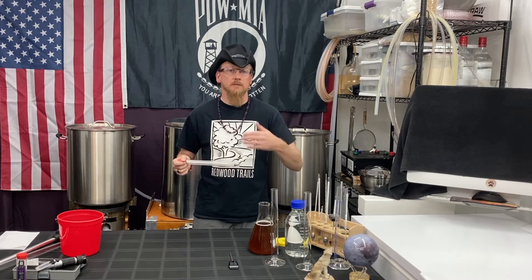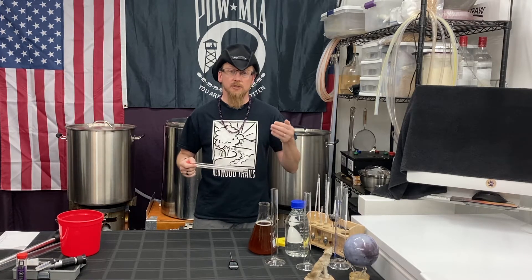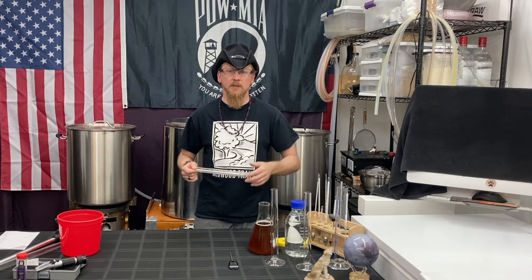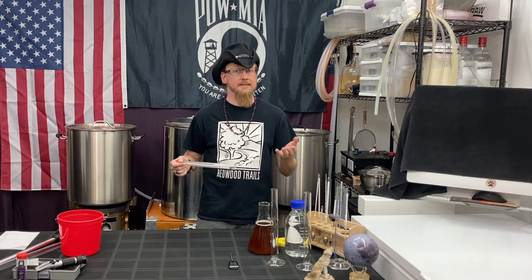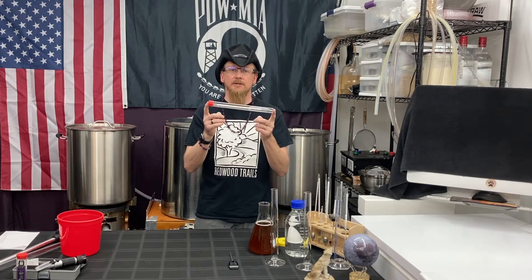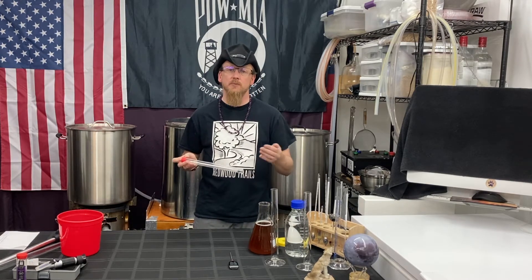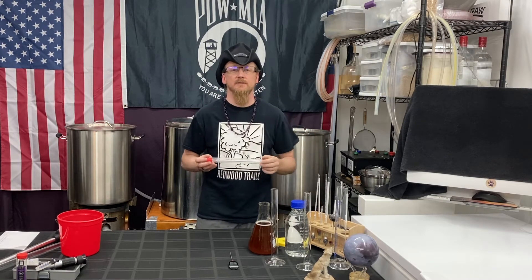As we add sugars, like we do when we create a beer — we're creating wort, which is sugars and flavors in the beer. As we add more and more sugars, the water gets more dense, gets thicker, gets heavier. We can measure that with a hydrometer. The more sugars we put in there, the higher the density, the higher the number in the specific gravity.